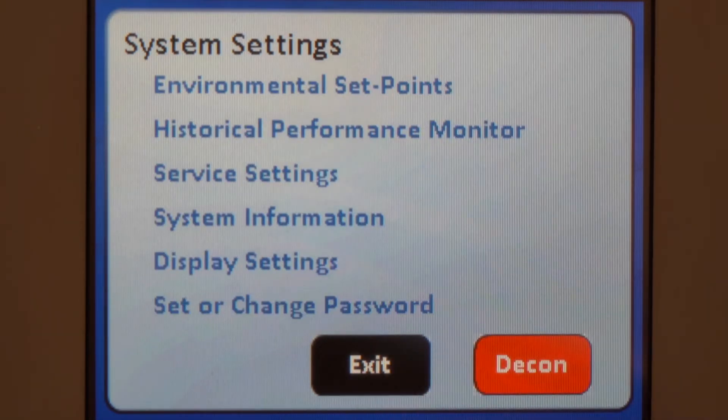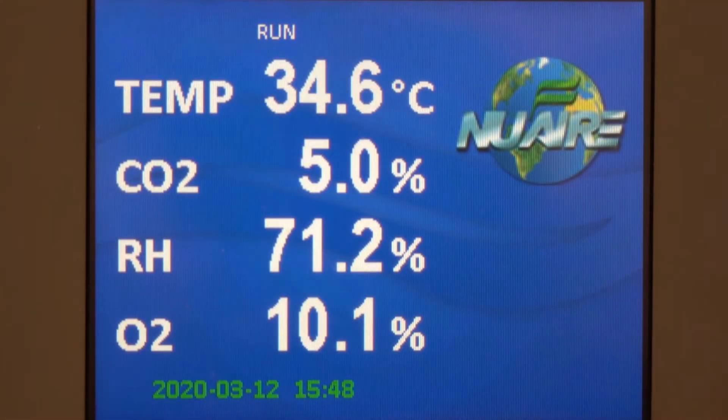Exit back to the main screen. With the special settings configured, you are ready to humidify the chamber with the water pan.